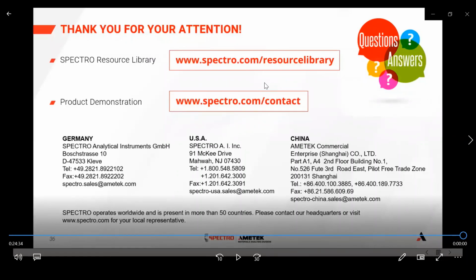And honestly, at that point, it would tell you this sample is not good enough for an OES analysis because there's too much free graphite in there. So it does extend the time somewhat, but it is a great time saver in general compared to having to prep as well as do 100% combustion analysis.